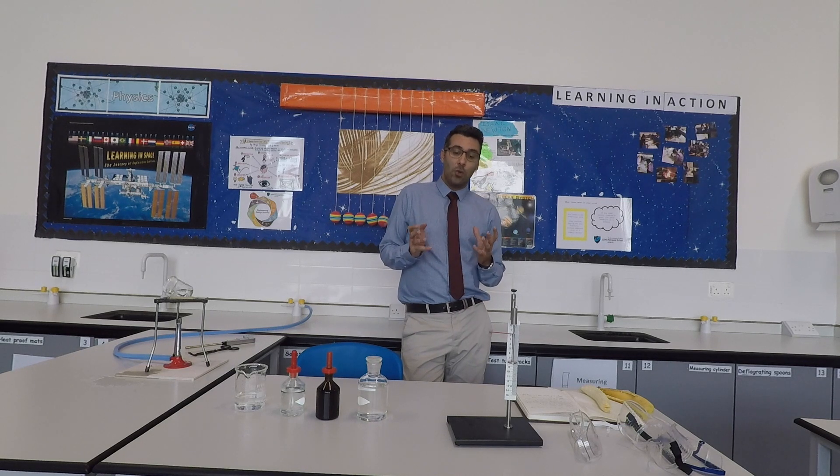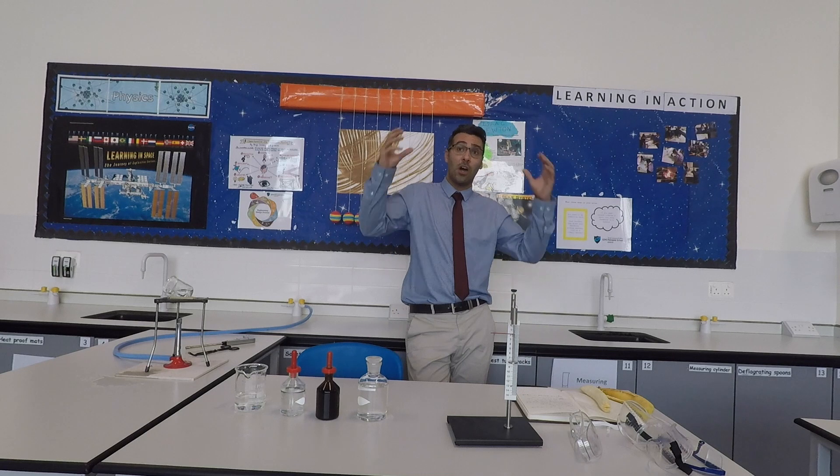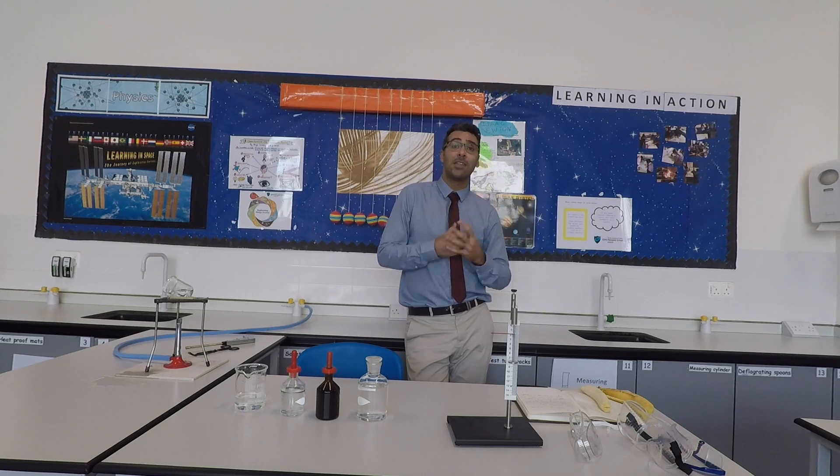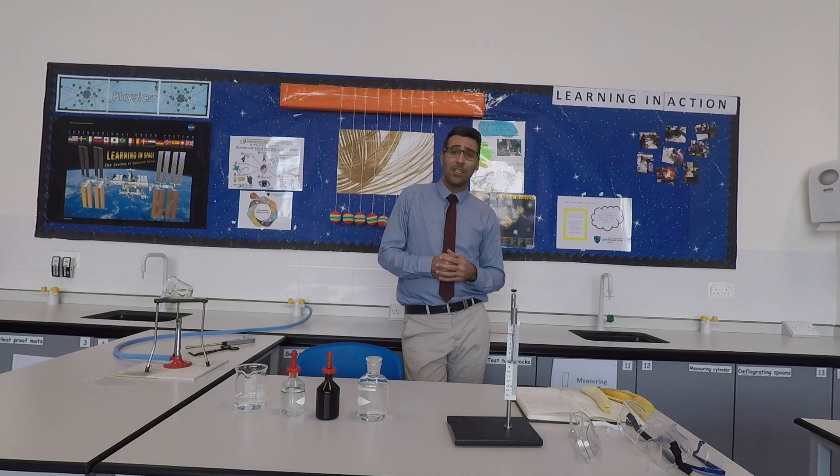When you have to do an experiment, you have to stand up behind your desk. You do not sit down unless your teacher advises you that you can sit for that particular experiment. Usually you do not sit — you stand up. You wear your goggles. You tie up your hair. You tuck your bags under your table — you don't want to trip over them. You do not bare your hair. And you do not eat or drink. All food should be away.